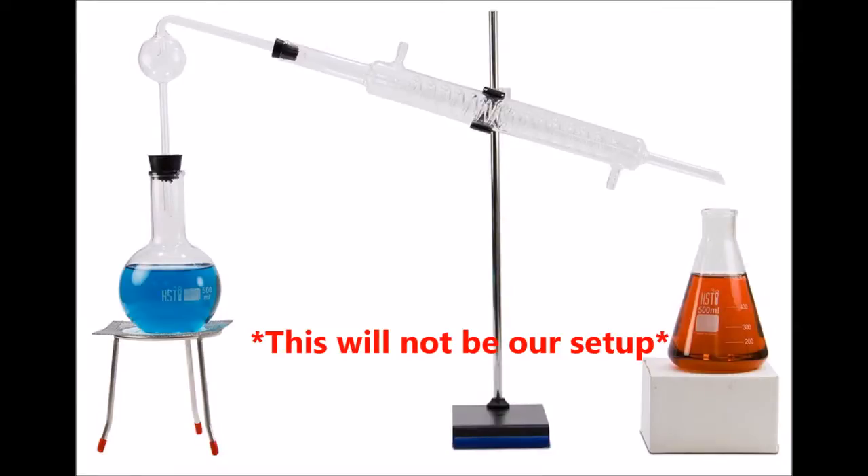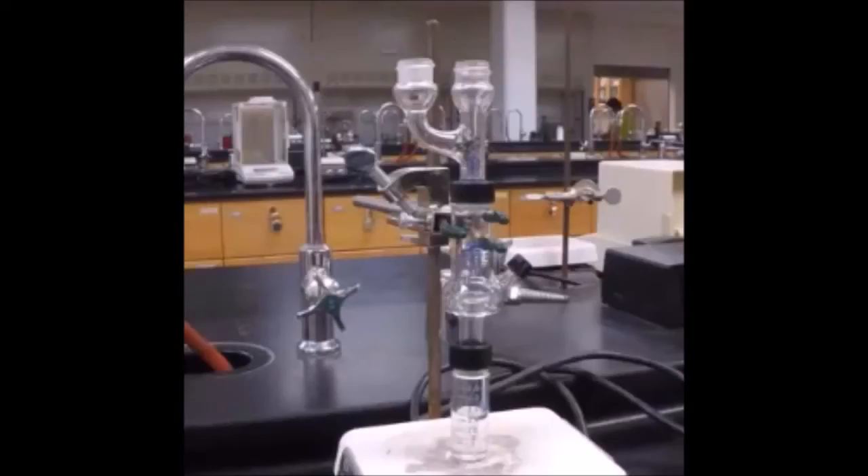Distillation is a technique used to separate a mixture of two liquids by leveraging the difference in boiling points between the two liquids. In this lab, you will be doing both a simple and a fractional distillation. In a simple distillation, the two liquids have boiling points separated by 40 degrees Celsius or more. In a fractional distillation, the two liquids have boiling points separated by 25 degrees Celsius or less.